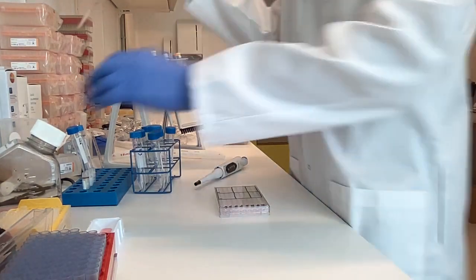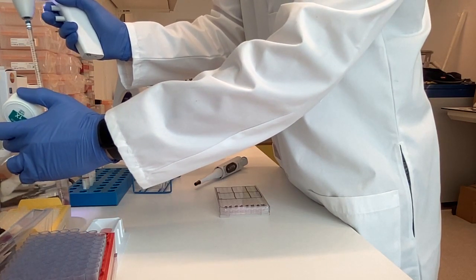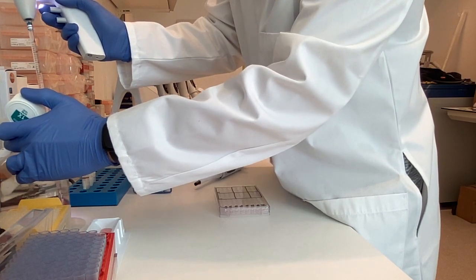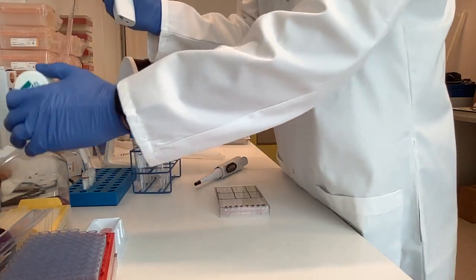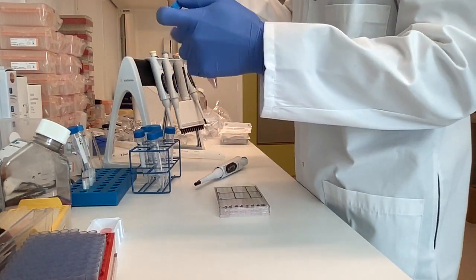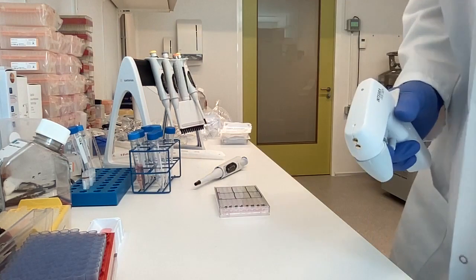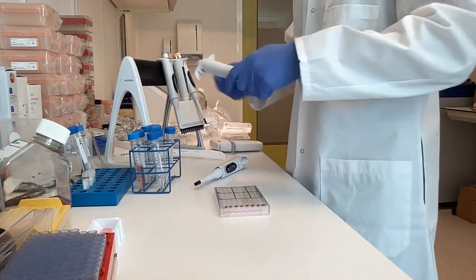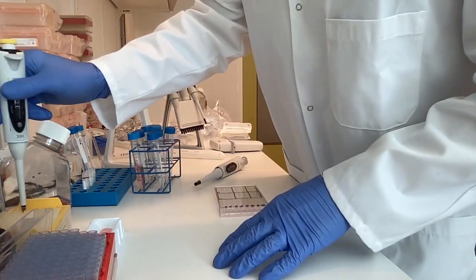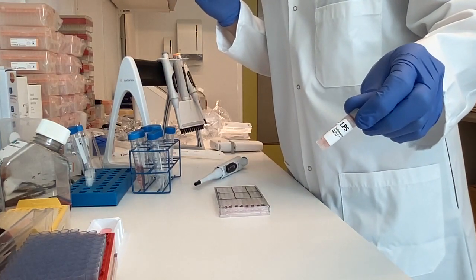So I'm going to take RPMI, again without the cell culture supplement. We're going to make 6 milliliters in total. So you're going to take 5,970 microliters of the RPMI. And next I will add 30 microliters of the LPS stock that we've prepared in the previous video.